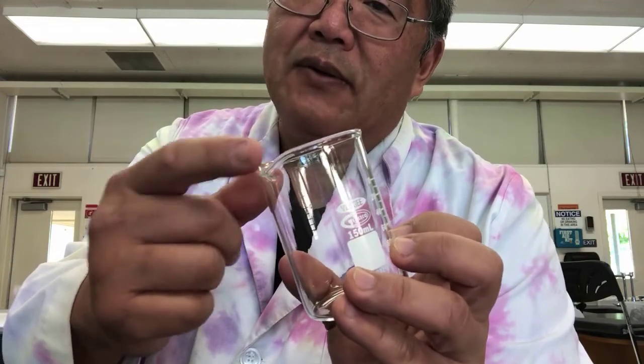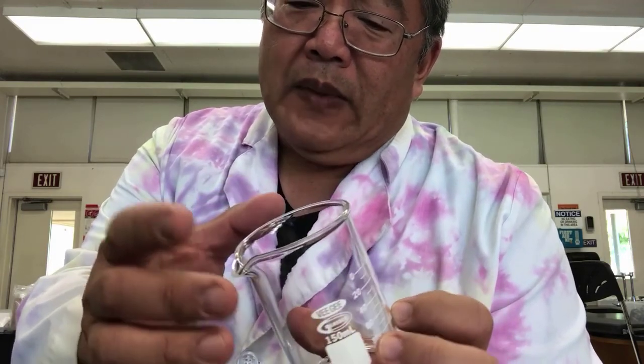If it's rounded, that is, it isn't sharp, it means that we saw it earlier and then we heated it to relieve the crack that's there. But cracked glassware, when you heat it, most often cracks more. And then if you have it full of liquid, that liquid goes everywhere. If you have it full of a flammable liquid and you're heating it with the flame, then that flammable liquid goes everywhere on fire. Okay, so thing to remember, check your glassware to make sure it doesn't have cracks.